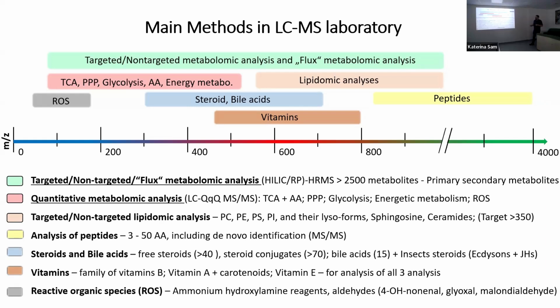For each metabolite, it's possible to measure quantitative information. But our research is focused on primary metabolism, not on secondary metabolism. And this is typically a problem for cooperation because we don't have standards of secondary metabolites. We cooperate with Martin Wolf and Katka-san, and we have, I don't know, 100 standards of secondary metabolites, but this is the number of primary metabolites in our lab, and it's a really big difference.